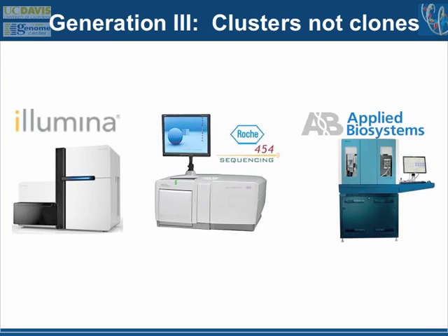So what happened was all these previous methods basically revolved around the Sanger sequencing technology related to clone-based sequencing. You had to take the DNA, put it into E. coli, grow up lots of copies of those E. coli, and then sequence off of those clones. And again, the automation of colony picking, clone preparation and DNA preparation was a key part of this whole process.